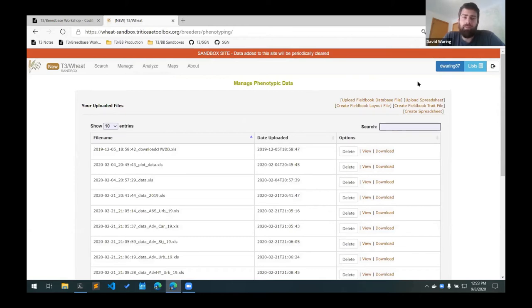What we have is a phenotyping spreadsheet. So we will use the upload spreadsheet link here.